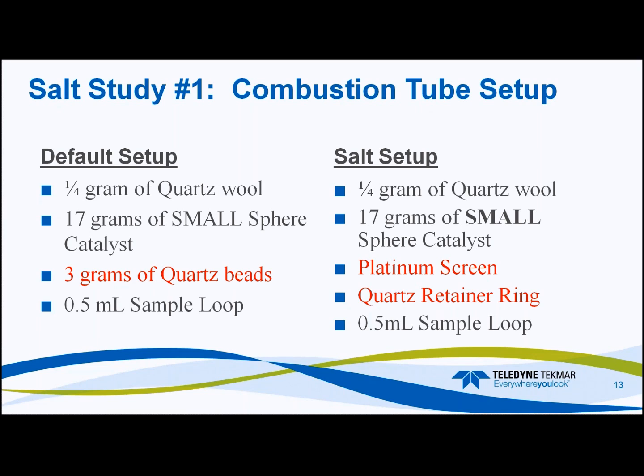In some cases, as we're going to show in the salt setup, we use a platinum screen and a quartz retainer ring. On each of these, we used a 1/2 mil sample loop.